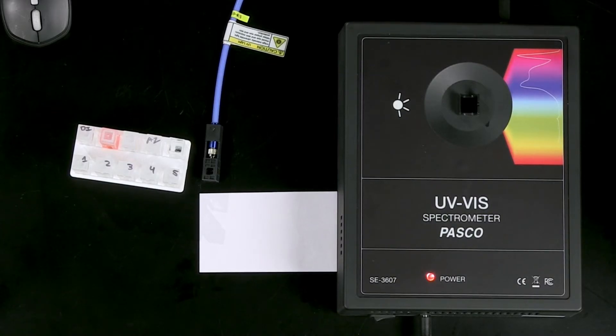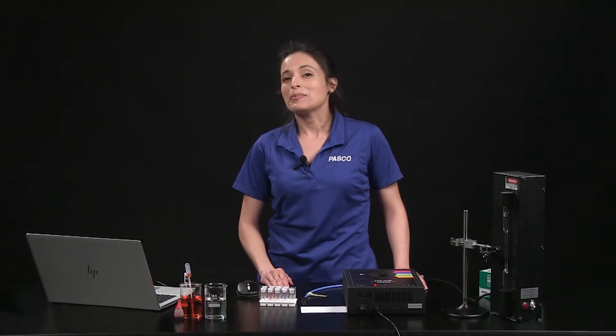The UV-VIS spectrometer has a wavelength range from 180 nanometers to 1050 nanometers. This range includes a portion of the UV range and the entire visible range and part of the near-infrared region of the electromagnetic spectrum.